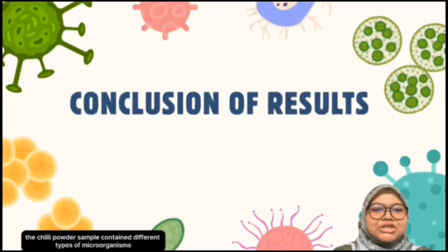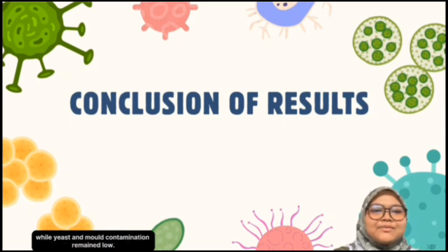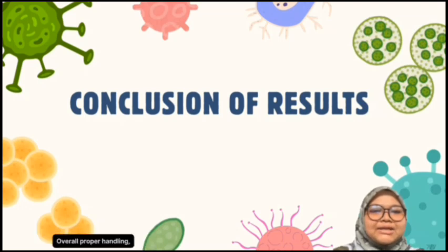In conclusion, the chili powder sample contained different types of microorganisms, including aerobic and anaerobic bacteria, while yeast and mold contamination remained low. Overall, proper handling, storage, and hygiene practice are important to maintain the microbial quality and safety of ground spices.